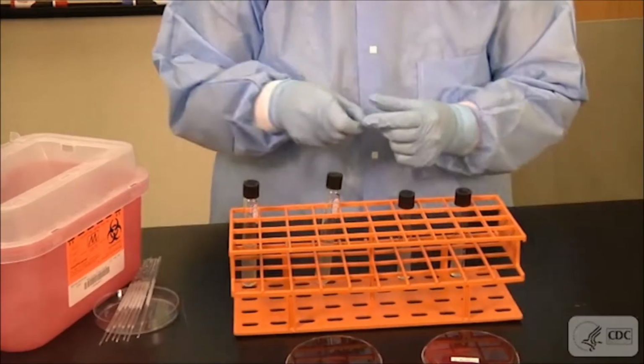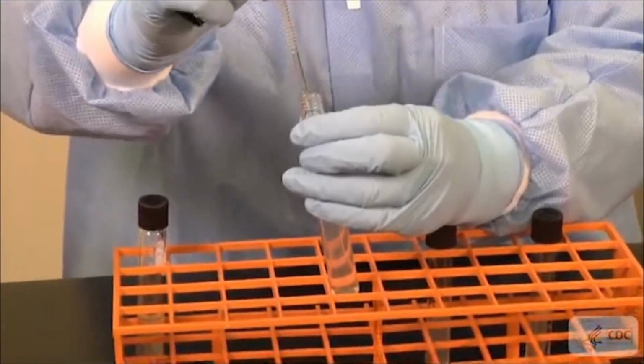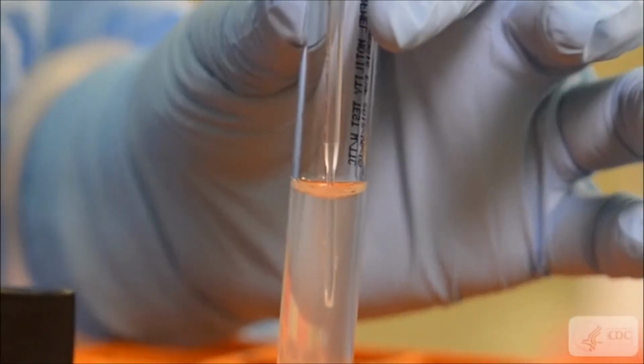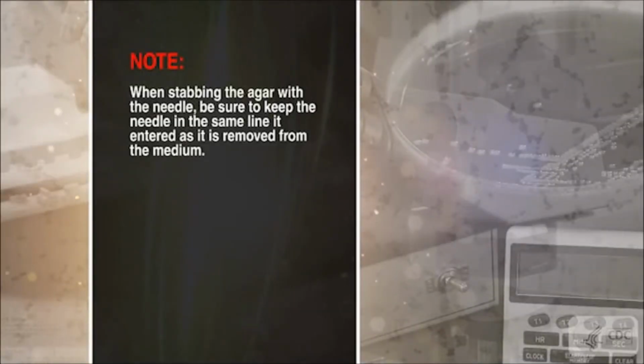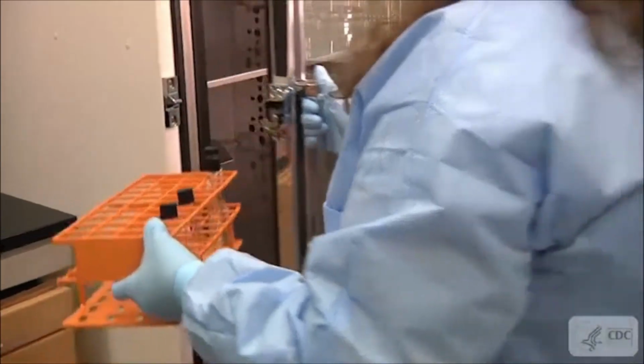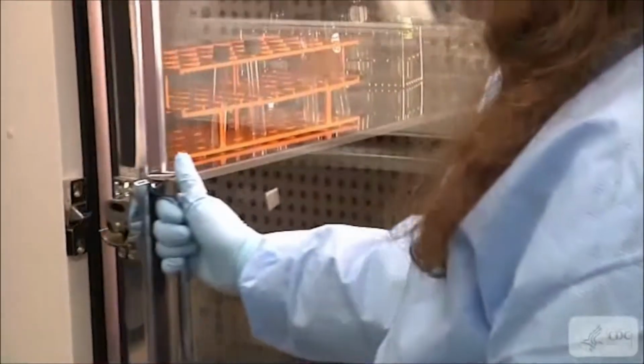With the sterile inoculating needle, pick an isolated colony and stab the labeled tube medium straight down through the center to a depth of 1/2 inch from the bottom of the tube. When stabbing the agar with the needle, be sure to keep the needle in the same line it entered as it is removed from the medium. Incubate at 35 degrees for 18 to 24 hours.